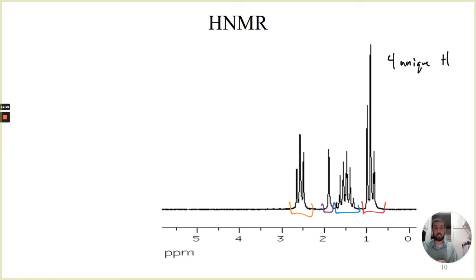The next part of this is I could go through and break down that chemical shift where those fell. So if we looked at chemical shift, that red one, I won't specify the value, but the interpretation, maybe I do want to specify the value. The red one falls in at about 0.9. If I was to interpret that, really simply, I have a hydrogen bound to a carbon. Alkanes, there isn't a whole lot else with it.